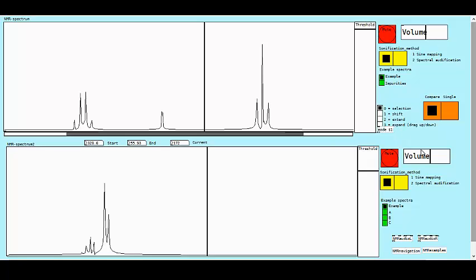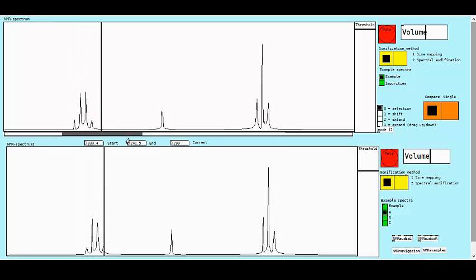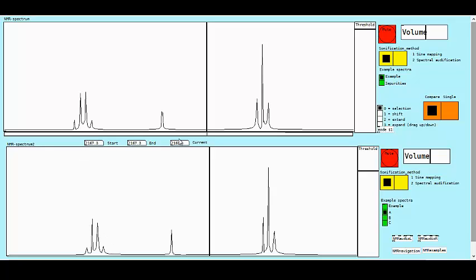Essentially what the users were asked to do for their final test was take these examples A, B and C and compare the three of them. So if we compare just this area, you can hear that this spectrum here is slightly shifted forward from this one, and that's also true if we listen to them spectrally. You can hear that it's slightly shifted.